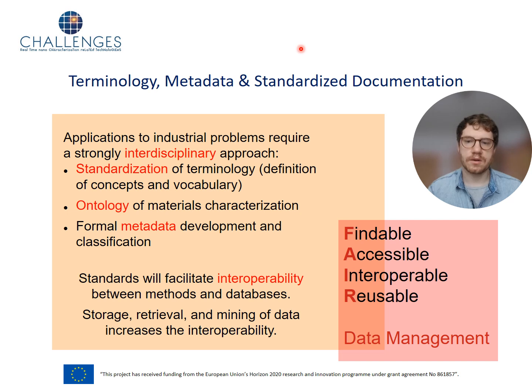So how can then the interoperability and the harmonization be achieved? So this is done by introducing terminology and standards. So stakeholders must find common terms with which they describe the data in terms of metadata. For this, ontologies can help, which are in essence systematic descriptions of names for specific data. And this all lies then in the framework of FAIR, which I also talked about before, which means that the data should be findable and accessible, interoperable and reusable.